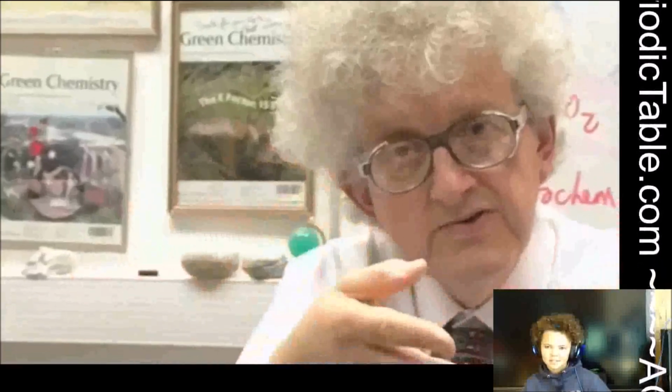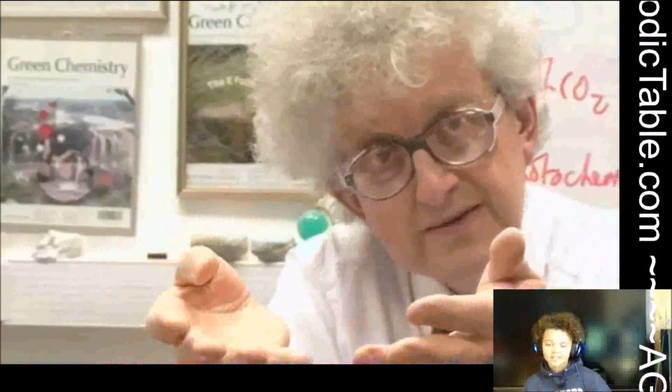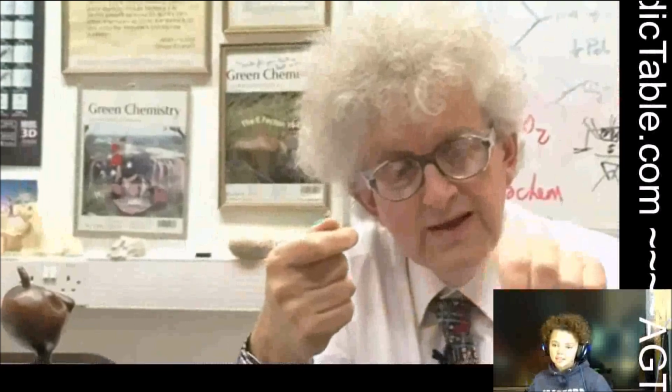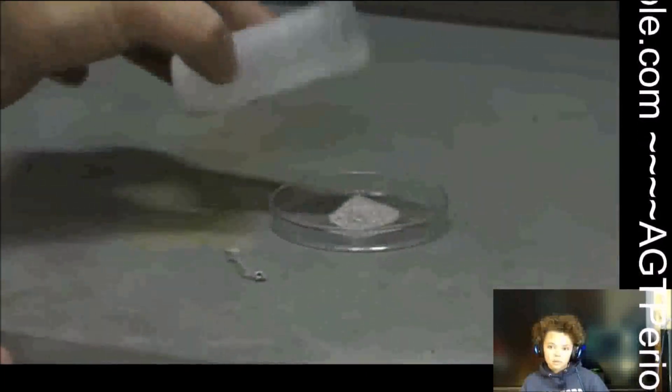Silver will conduct electricity. It will also conduct heat. If you've ever tried stirring tea with a silver spoon, it gets very hot. You tend to drop it. It also conducts electricity well. So we're going to repeat the reaction so that you can see it again, because that was really fast. This time we're going to do it on a glass dish so you can see it a bit better. And we'll pour out a small amount.